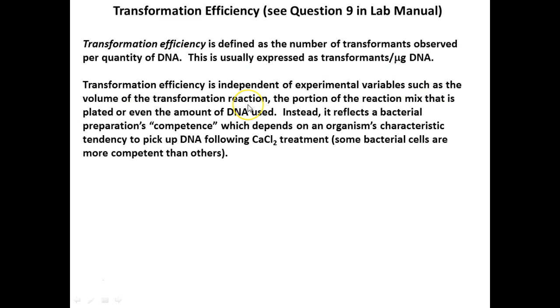I know this once because I made a mistake and put 500 microliters in each one of the tubes. I actually told someone else to do it for me and forgot that we had changed it to aliquoting for you guys. But it still worked, right? So volume doesn't matter. And I've done this, so I know it definitely doesn't matter. The portion of the reaction mix that's plated, or even the amount of DNA used, doesn't matter.